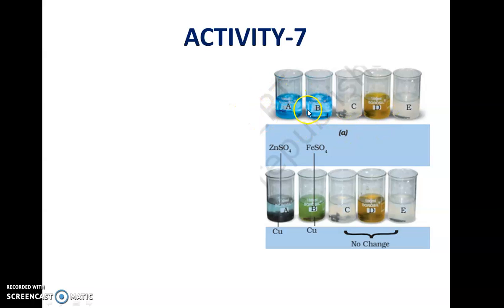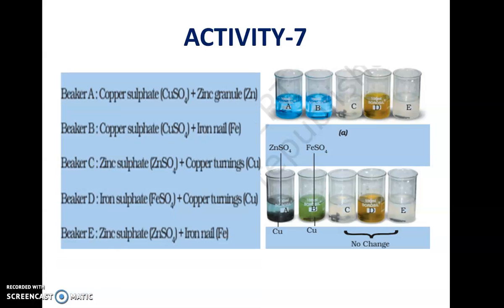The first two solutions are made of copper sulfate. Take some water in all the beakers and mix the copper sulfate in the first two beakers. In C and E we have to mix water with zinc sulfate. Now in beaker D there is iron sulfate.